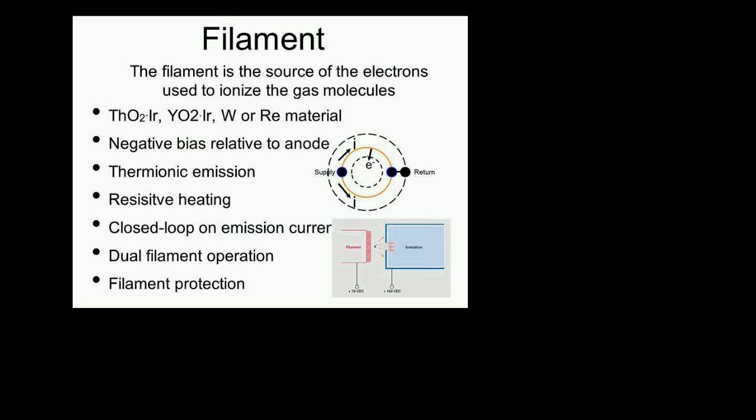So if you make a mistake and you overpressurize the system, particularly with air, they will not fail because of a short overpressure condition. Whereas if you use a tungsten filament and you get an inrush of air, the oxygen will react with the tungsten, which is at about 1800 C, and your tungsten will immediately vaporize as tungsten oxide.